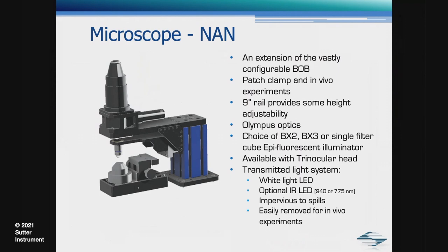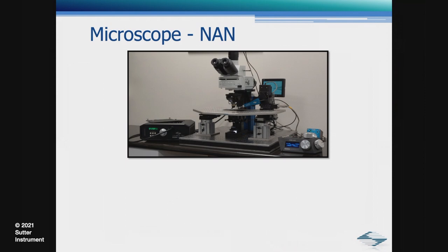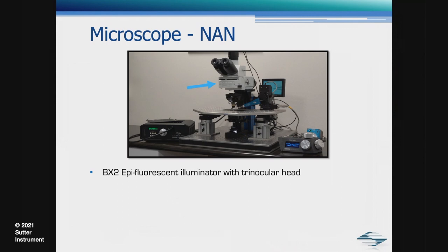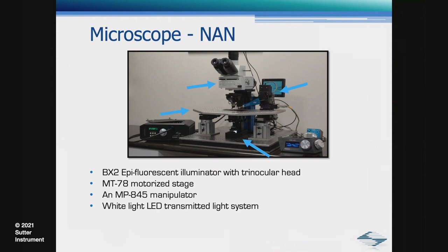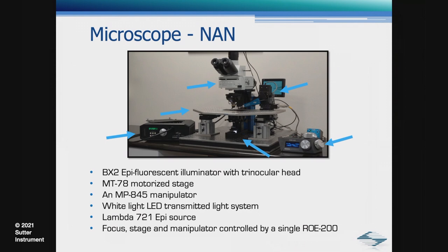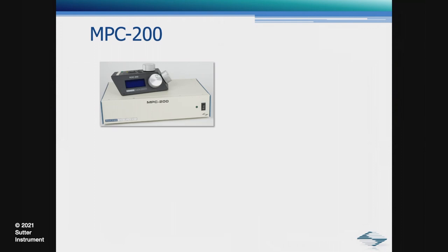Here we have a NAN configured for patch clamp recordings. It includes a BX2 epifluorescent illuminator with trinocular head, an MT78 motorized stage, an MP845 manipulator, white light LED transmitted light system, Lambda721 as our epi source. The focus, stage, and manipulator are controlled by a single ROE 200. Let's now review the various components.